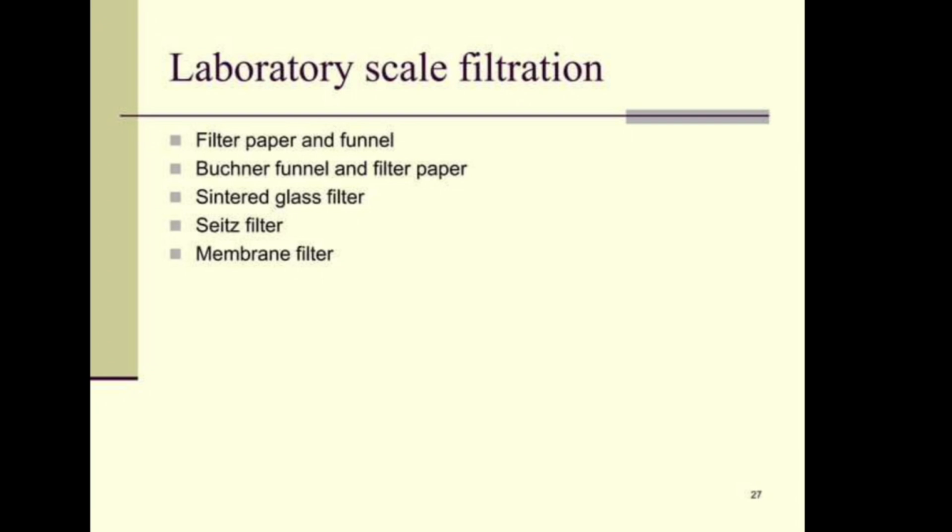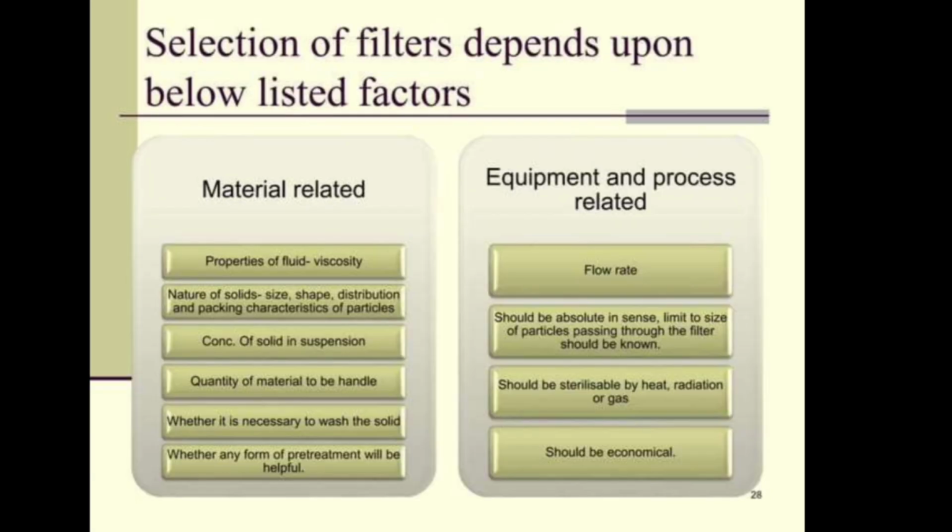In today's class, I discuss laboratory scale filtration. There are the filter paper and funnel, Buchner funnel and filter paper, sintered glass filter, and membrane filter. Selection of the filter depends upon the below listed factors.